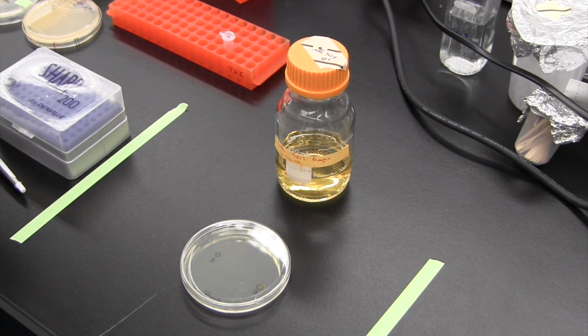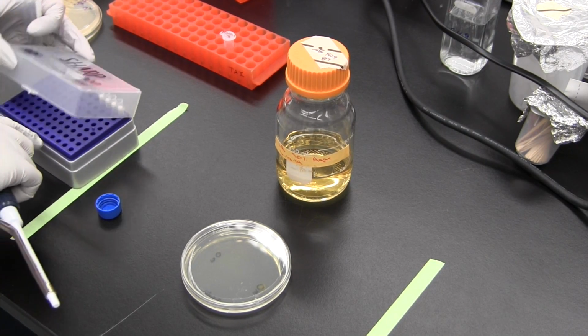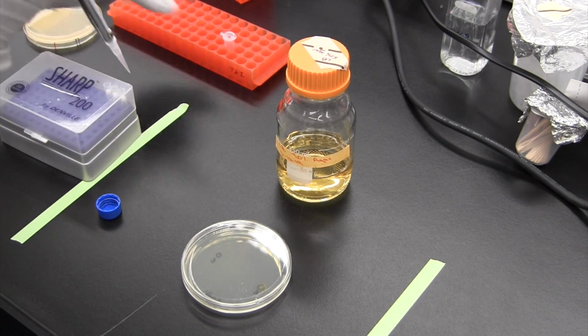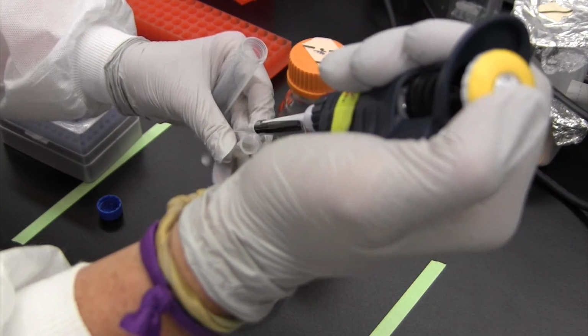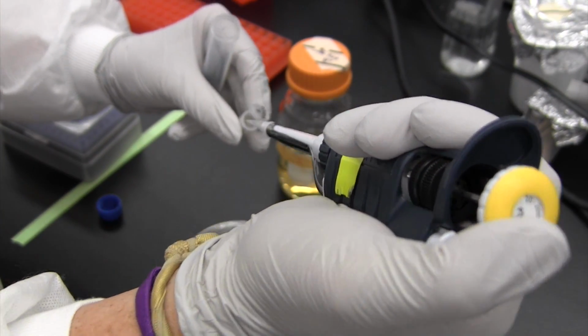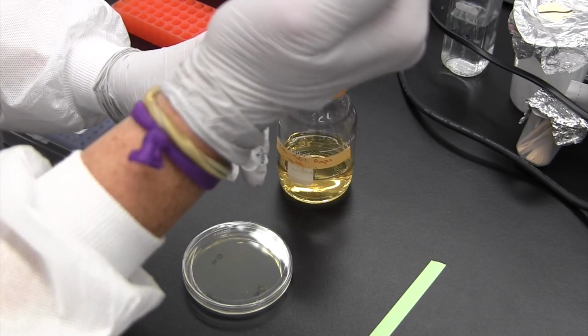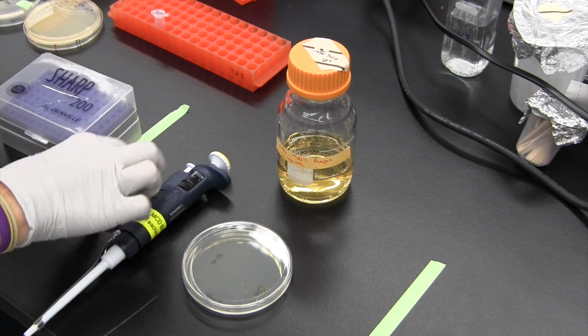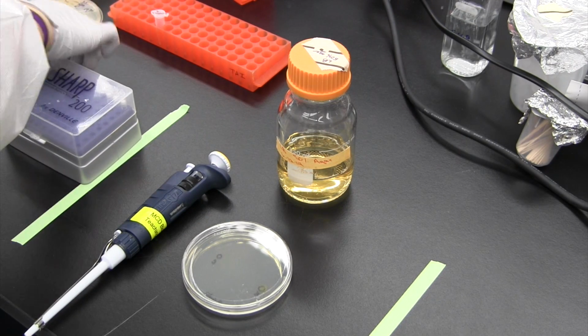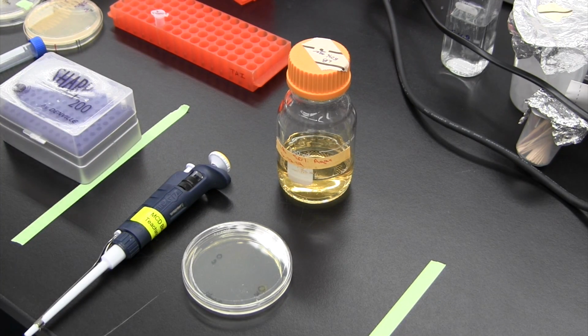I think the key is to make sure that you have a good even distribution of the bacteria in your agar. So here I'm just going to add 100 microliters to the bottom. And 7 mils.